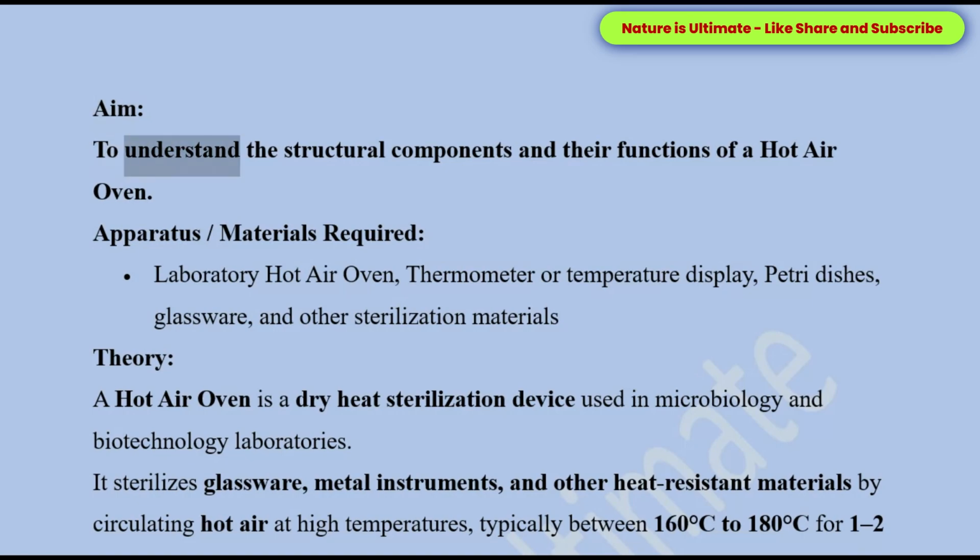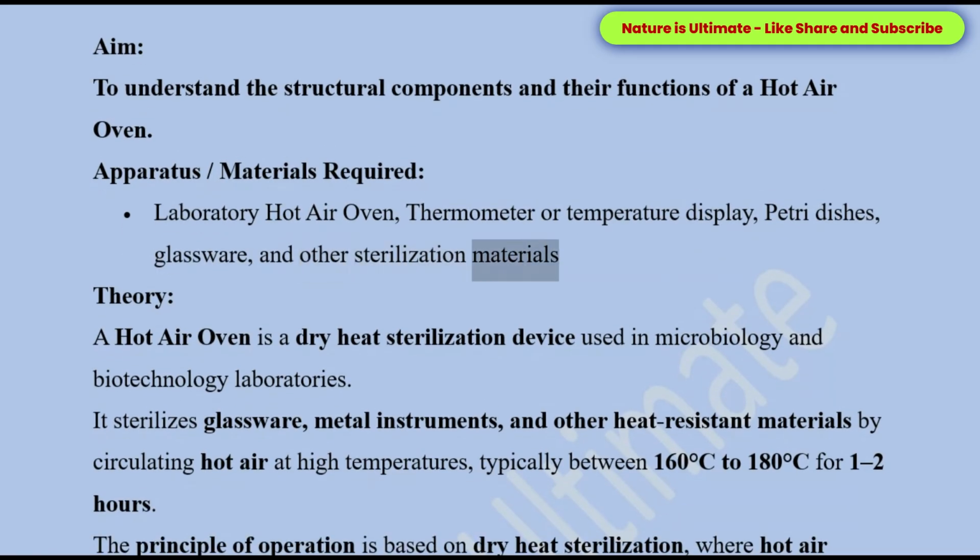Aim: To understand the structural components and their functions of a hot air oven. Apparatus/materials required: laboratory hot air oven, thermometer or temperature display, petri dishes, glassware, and other sterilization materials.